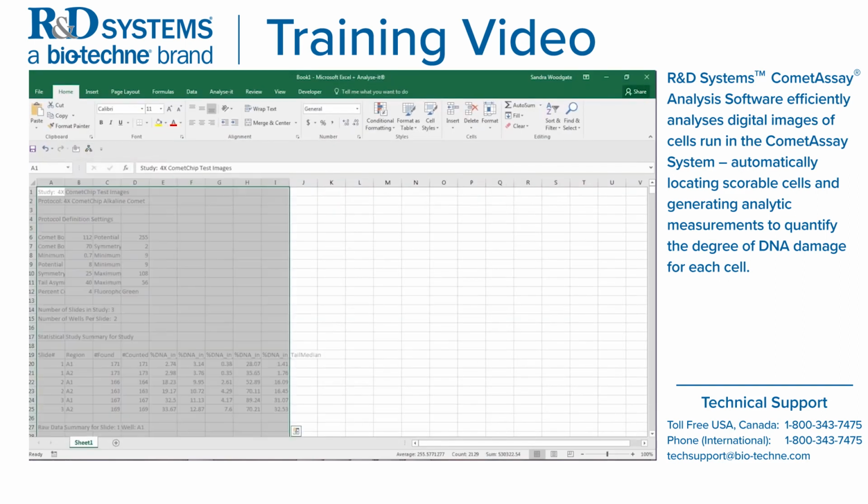When you paste the data, what you're actually seeing is the same data that you would see on a printout. You have the study name, which we called 4X CometChip test images. The protocol, which was used to draw the boxes, was the default protocol that comes with the software. It's 4X CometChip alkaline comet.